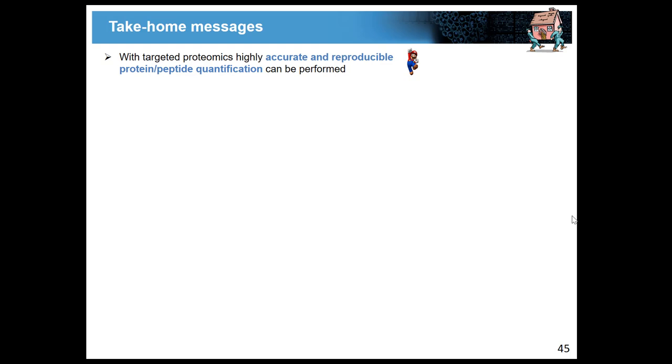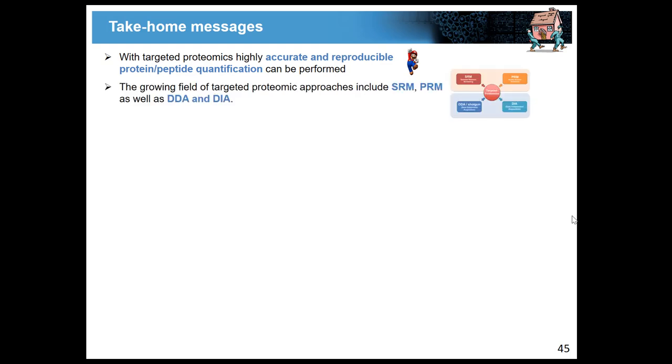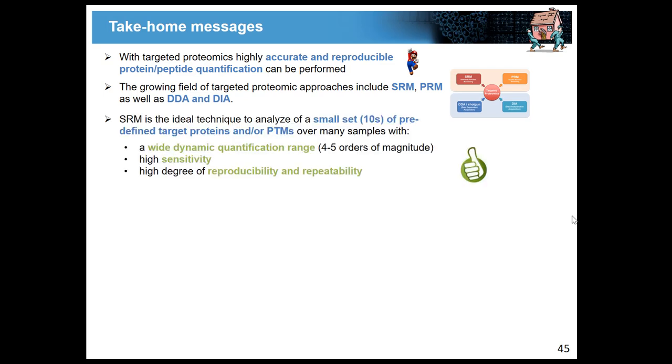Take-home messages from this presentation. I hope I could show you that targeted proteomics is a highly accurate, reproducible way of doing peptide and protein quantification. The field of targeted proteomics is really growing and booming at the moment. We not only have these classical SRM and PRM approaches, but you will hear throughout the week also much more about targeted DDA and targeted DIA.